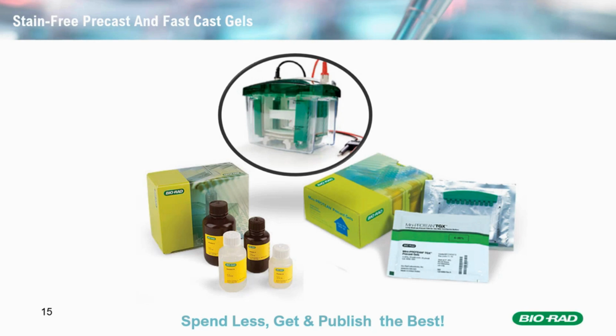The advantage is you don't need to wait between resolver and stacker. As soon as you cast the resolver, without any waiting and without using isopropyl alcohol or water, you can cast the stacker, and you just wait 30 minutes to polymerize.